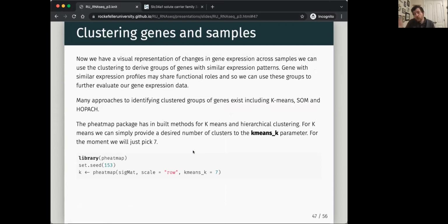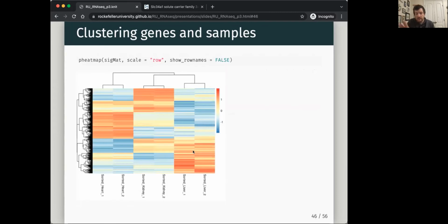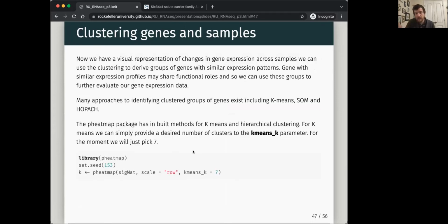And so quite often, as I said, pHeatmap uses hierarchical clustering as its default. There is a ton of methodology included within the help for how to do hierarchical clustering and extract out specific numbers of clusters with pHeatmap. But we're actually going to focus on k-means clustering for this. They are both good clustering methods, and I use both regularly. I'm not going to say one is necessarily better than the other. They work in different ways though.